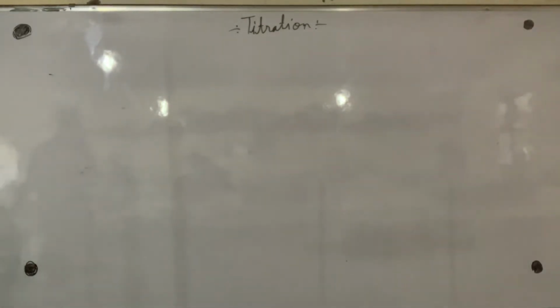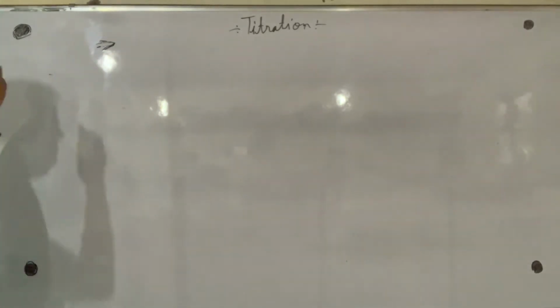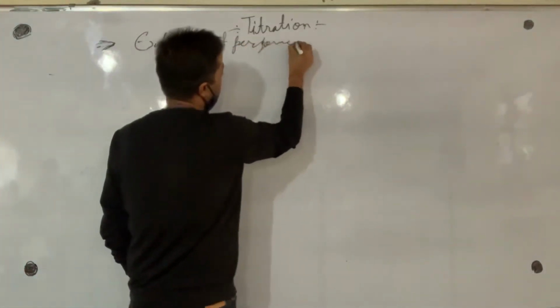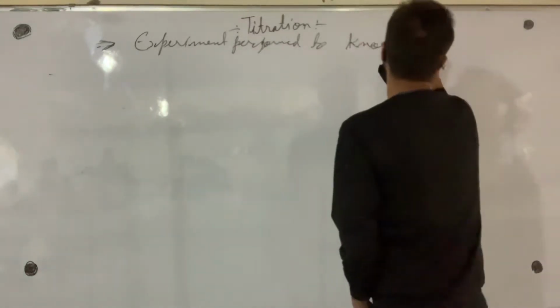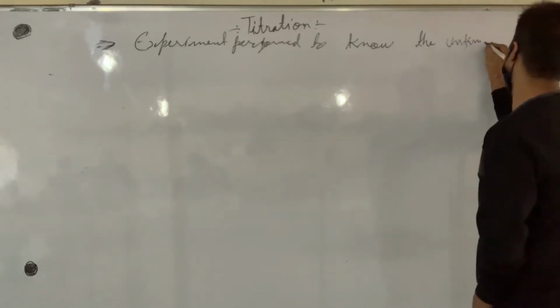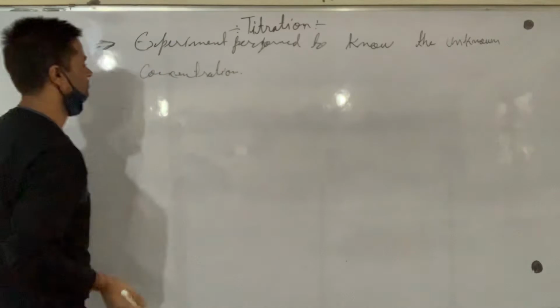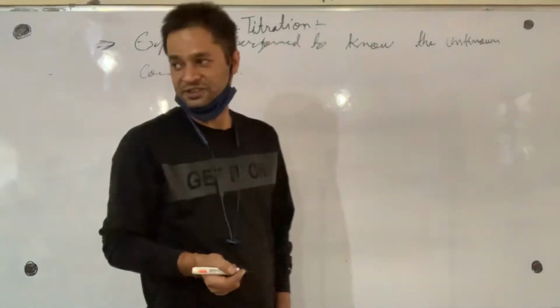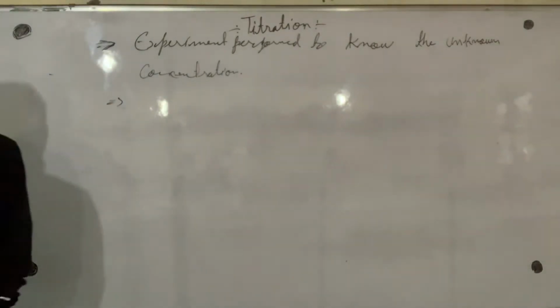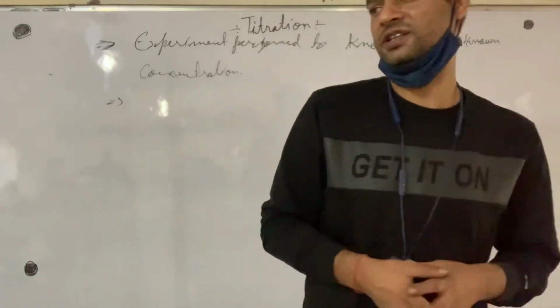What is titration? As I already told you, titration is an experiment performed to know the unknown concentration, by treating it against a solution of known concentration.